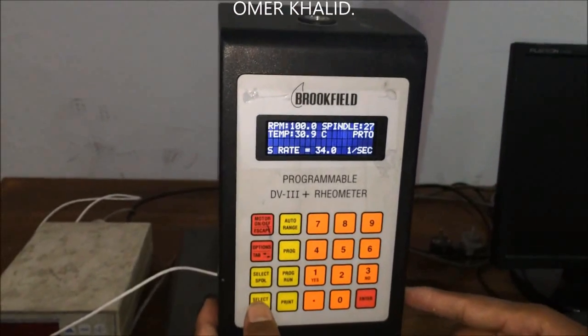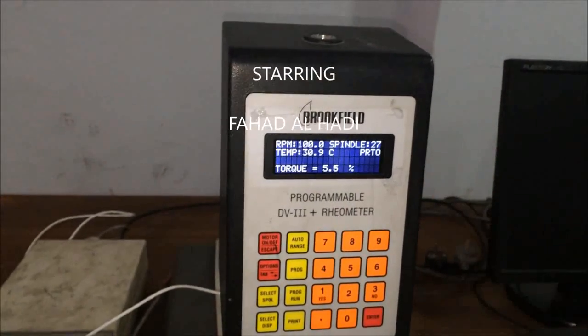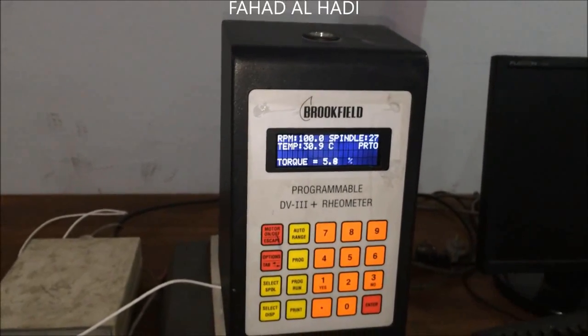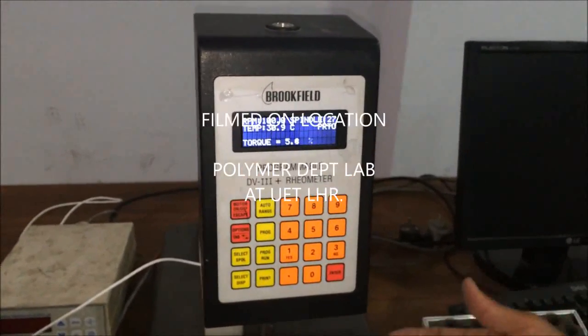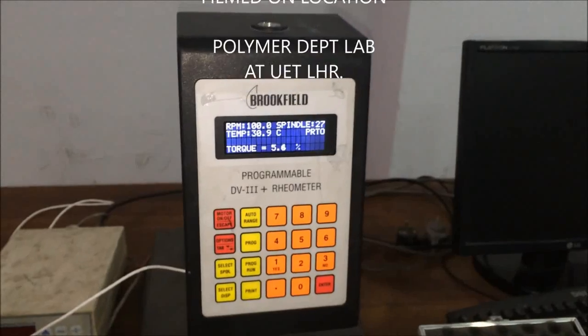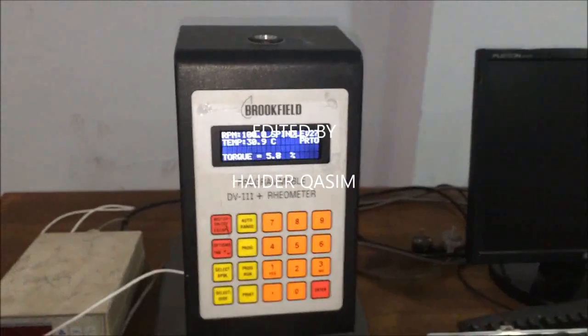After pressing the select display button again, we return to the home screen. We will continue to check viscosity, shear stress, torque, and shear rate at different RPM values. Thank you very much.